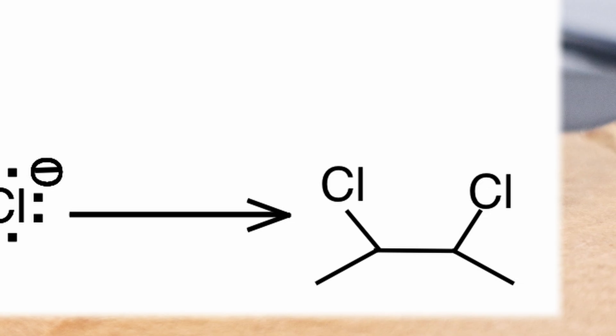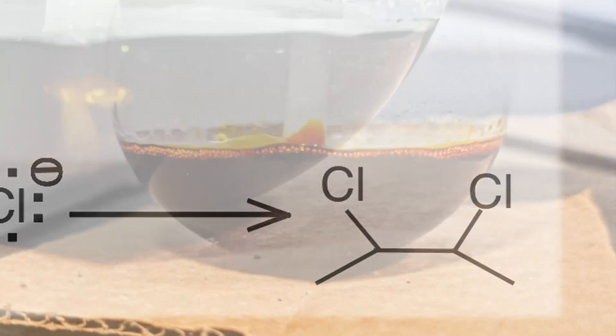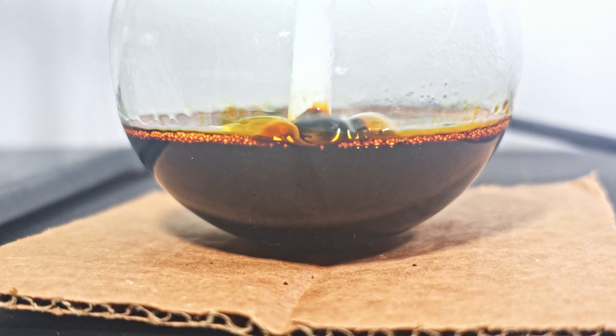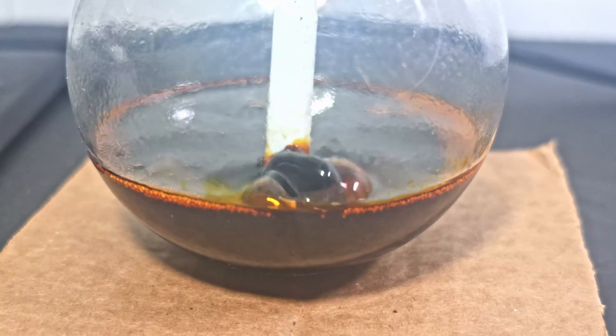Since the chlorine atoms are in each other's vicinity, this is called a vicinal dichloride. Eventually the chlorinated oil becomes very dark red, much like brominated oil. Just by the bubble formation, I can tell it is very thick and tarry.